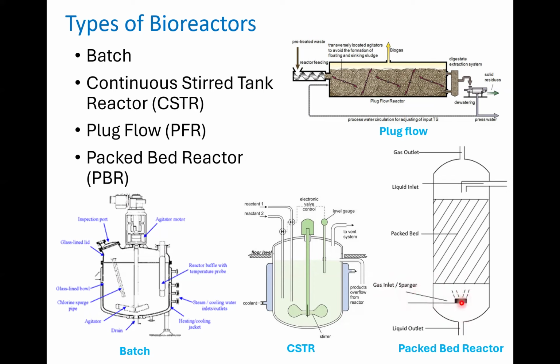The gas is basically the material that you need to use as feedstock to produce some other products. Through this kind of bed, it can react with the microorganisms or the enzymes, if you have immobilized enzymes, and by the end you can have the product. Again, if you have a liquid inlet, you can also have a downflow feeding of the system, and then collect the liquid from the outlet.